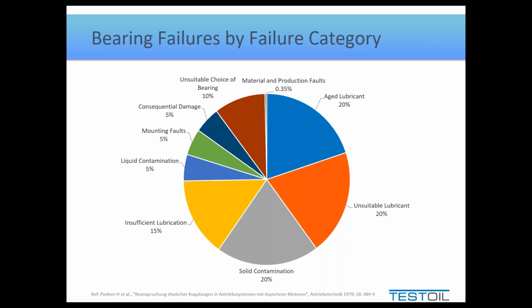And as you can see, the largest slices of the pie are related to either the lubricant directly or a contaminant. That's the common thread that we find with many lubricated systems: the findings of most oil analysis tend to relate to either contamination of said lubricant or possibly some improper uses or mixing of lubricants, these kinds of things.